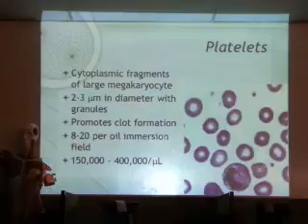And when it's finally mature, the cytoplasm matures into little bits and pieces of platelets, like these little round things. They're about 2 microns in diameter. They kind of flake off and get into circulation, and the rest of the cell will be recycled. So what we see in circulation are bits and pieces of cytoplasm. We call them platelets.